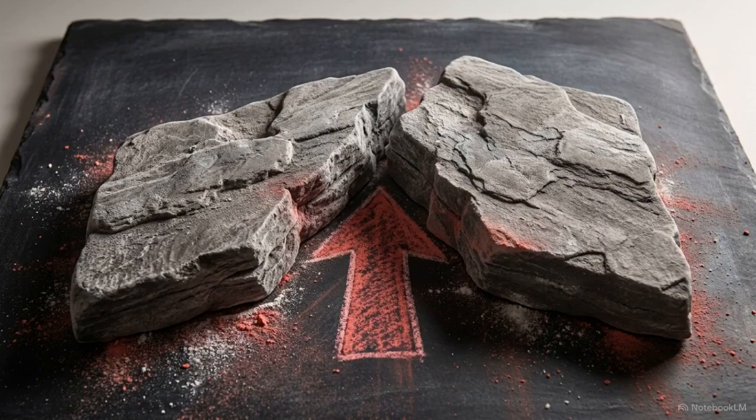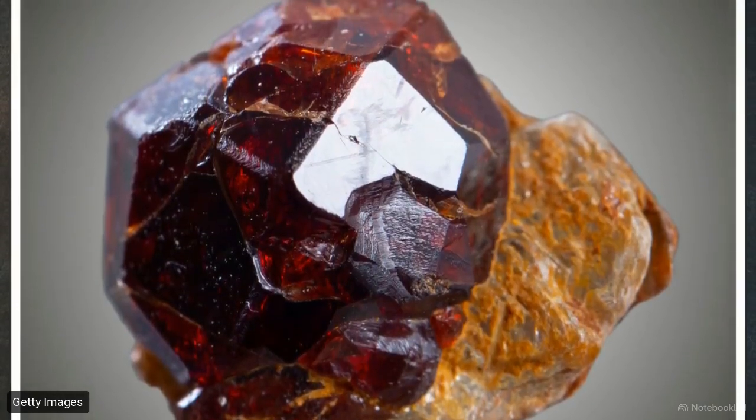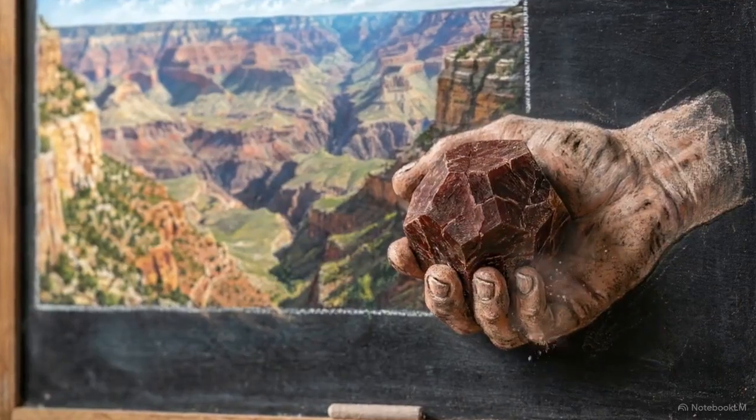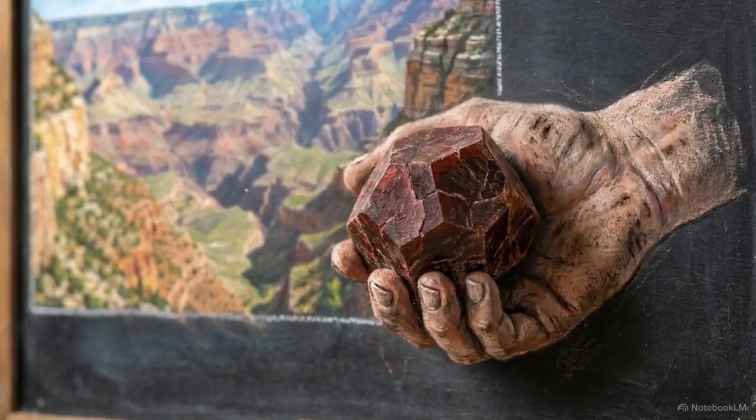Finding this specific symplectite texture indicates the rock underwent rapid tectonic decompression. It tells geologists that the specific tectonic plate holding this crystal was thrust upward through the Earth's crust. By leveraging the physics of electron scattering, we can reverse engineer the tectonic history of the Earth from a handful of nanometers.